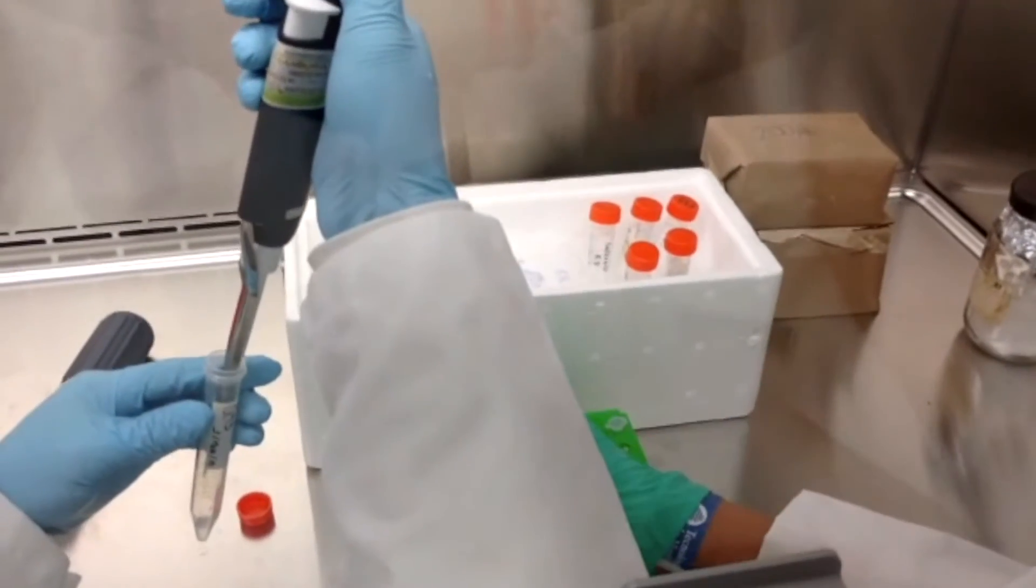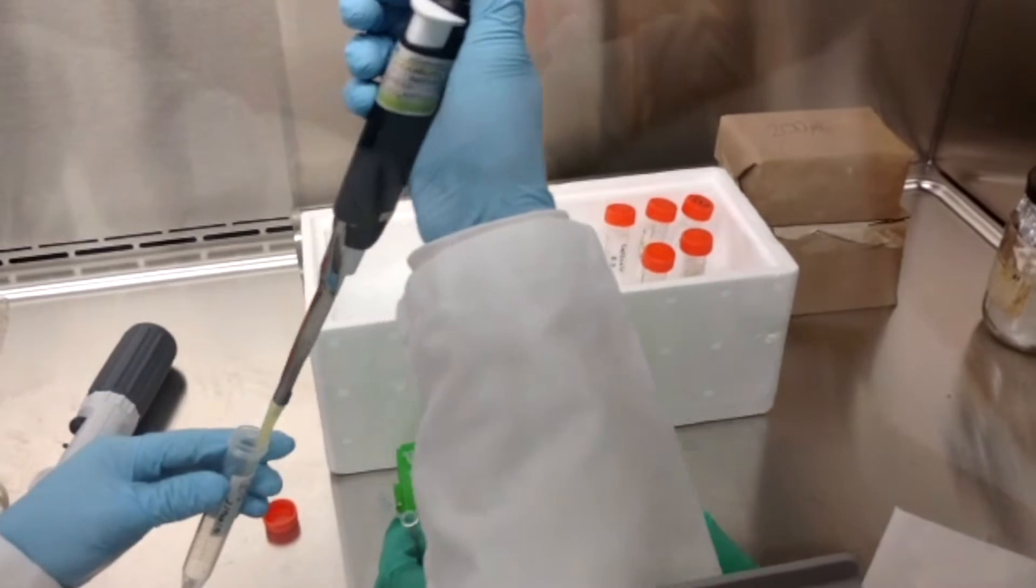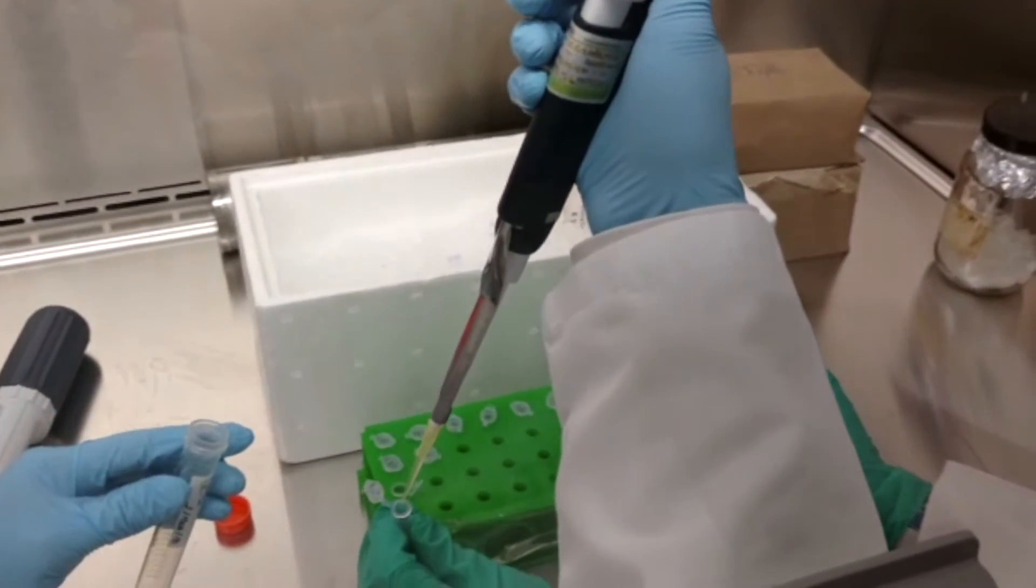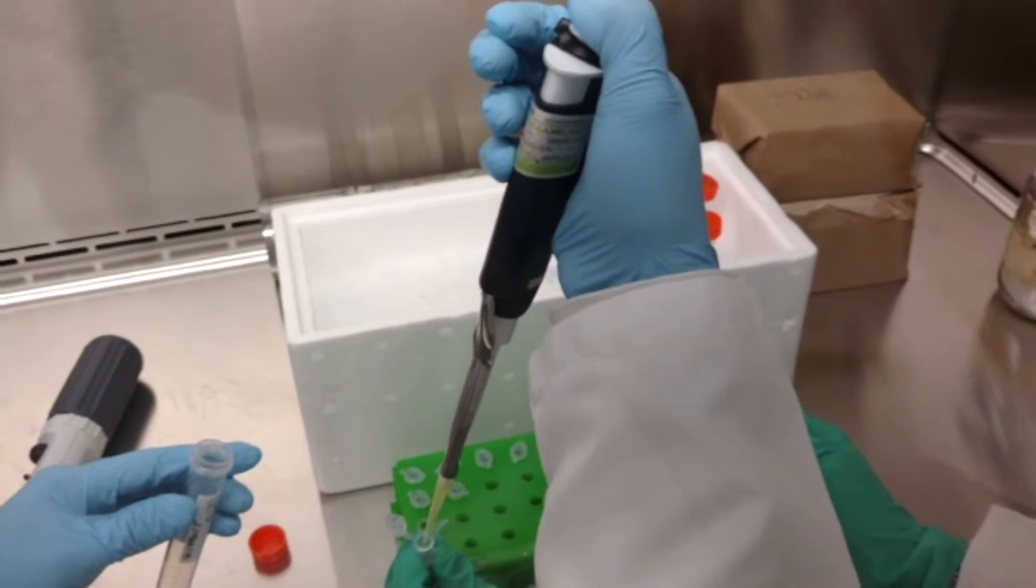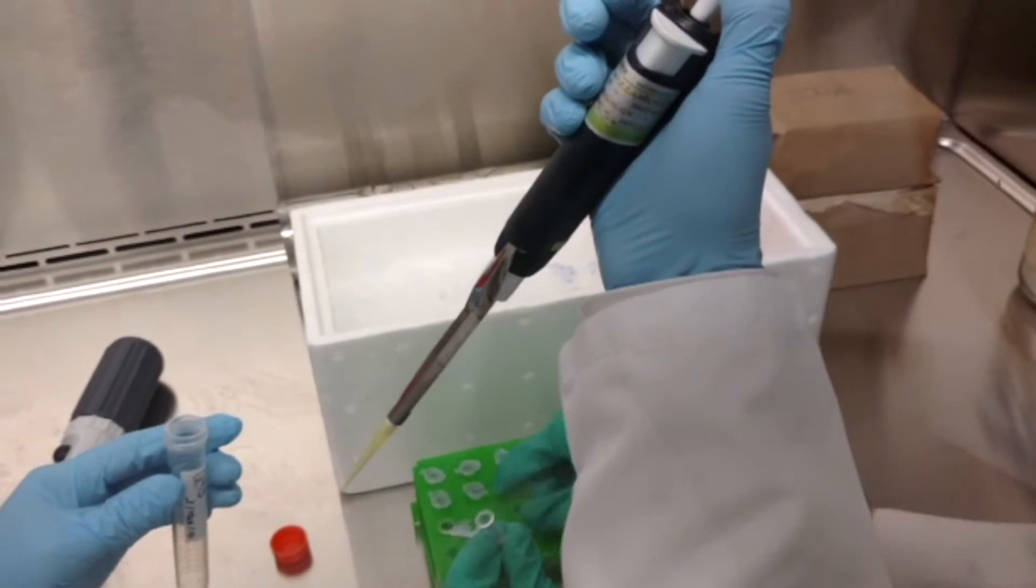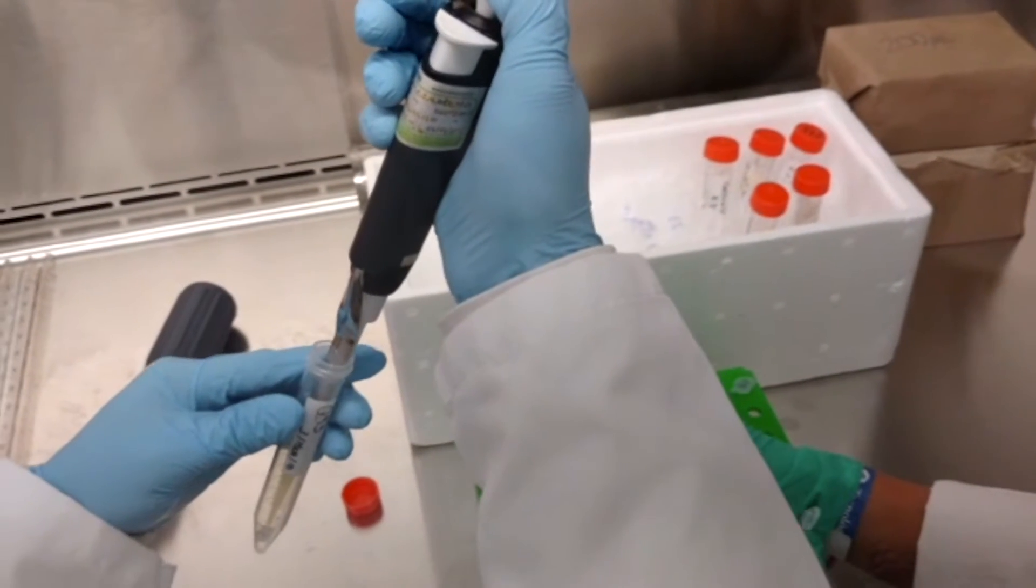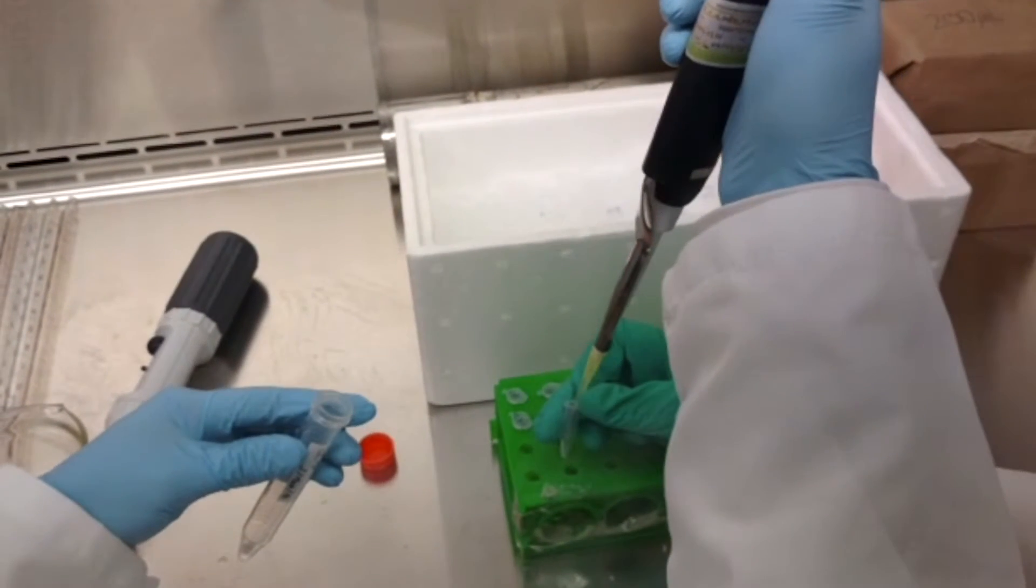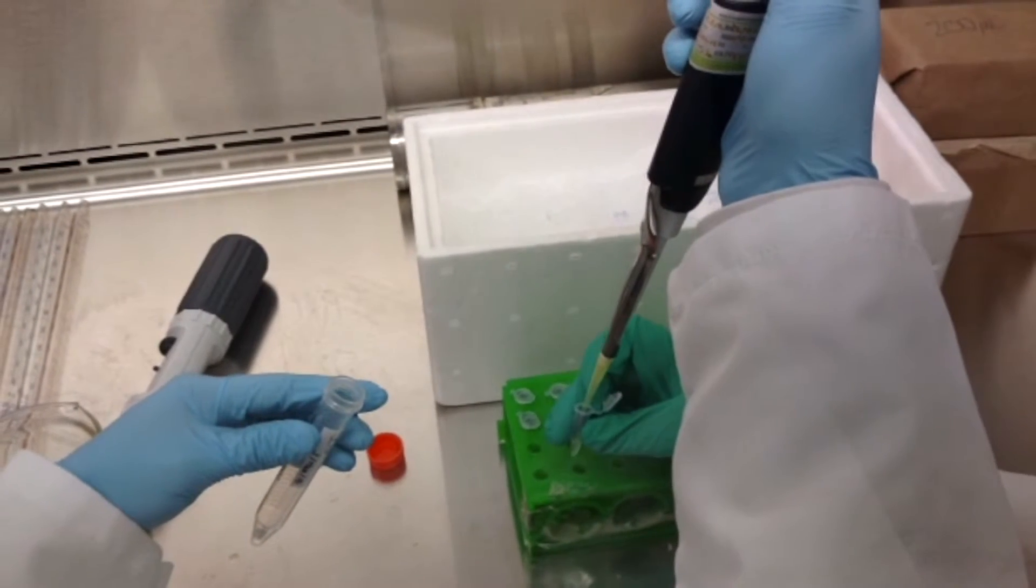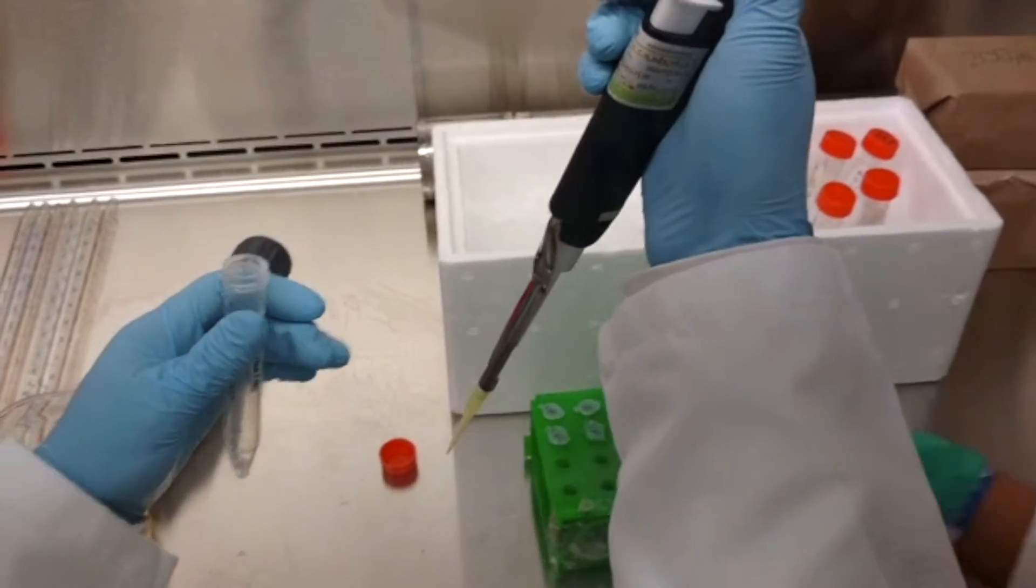Although every transformation requires high quality plasmids, the samples may differ in salt content depending on the method. For electroporation, DNA must be in a low ionic strength buffer like TE buffer or biology grade water. If the sample is contaminated with salts it can cause an electric arc, damaging both the sample and the machine. For chemical transformation, it is not as important to have a completely salt-free sample since that method does not involve electrical charges.